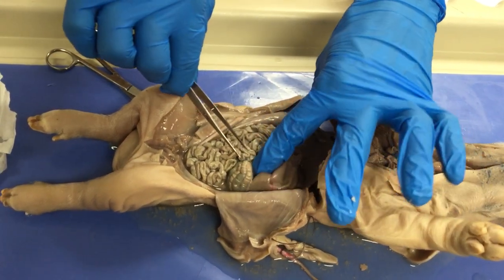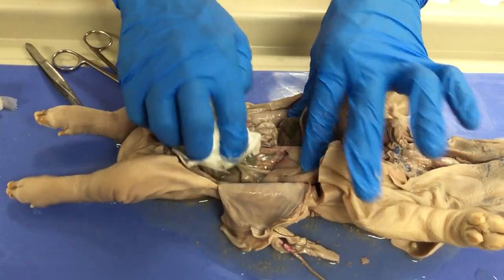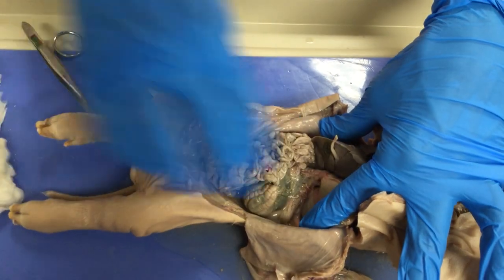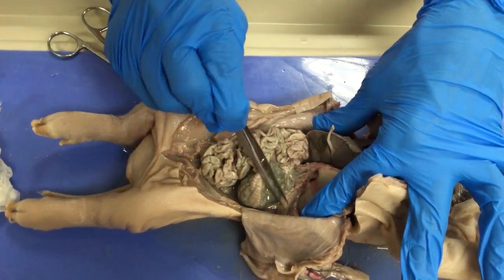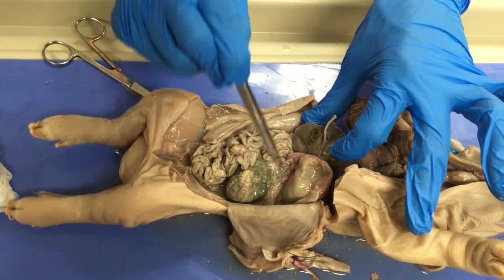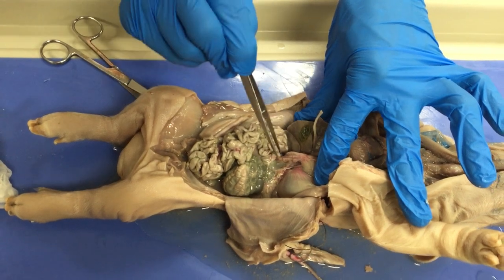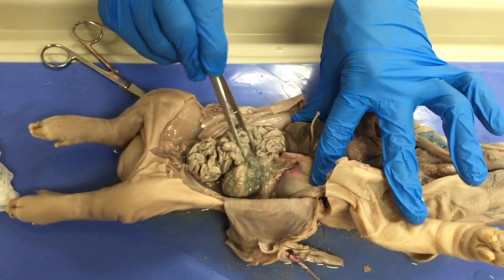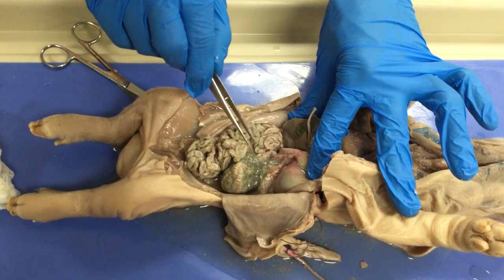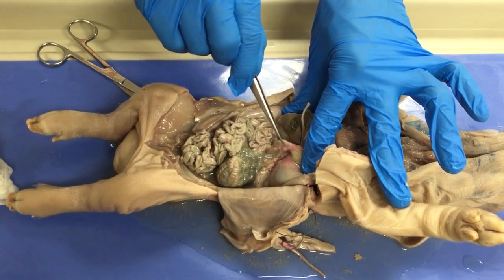This is where the pancreas, a gland found right behind here, empties its contents into the duodenum together with the gallbladder. These two structures — the pancreas and the gallbladder — empty their contents into the duodenum so we can digest not only fats, but also proteins and carbohydrates like starch that we might have ingested. This is the first portion of the small intestines, the duodenum.